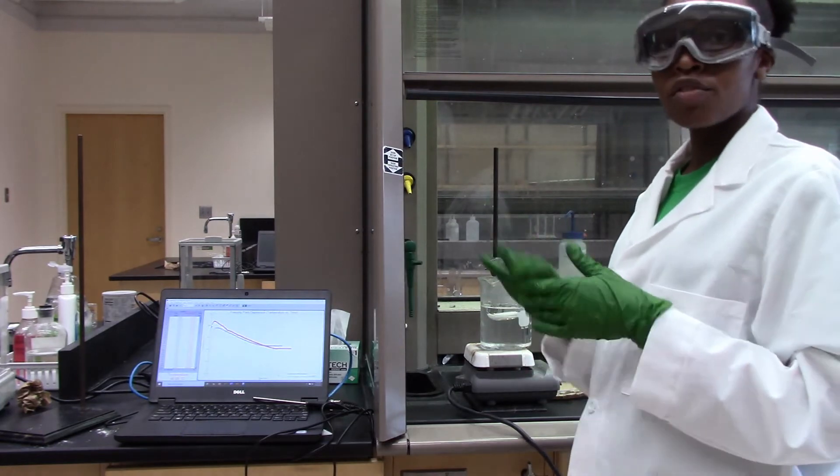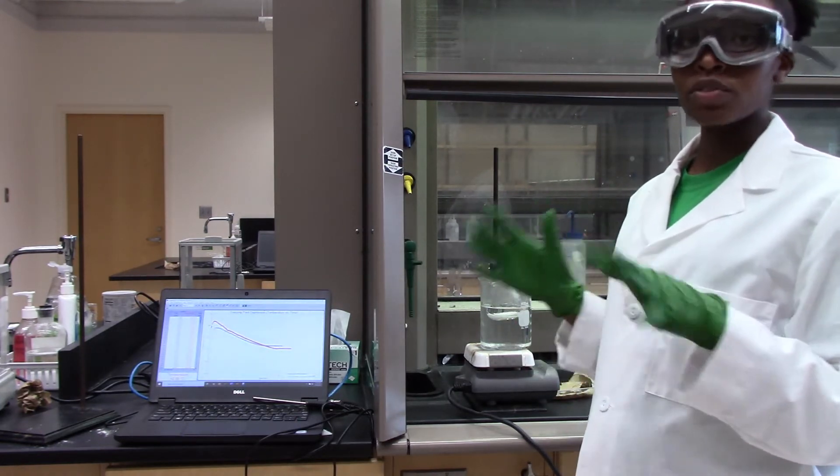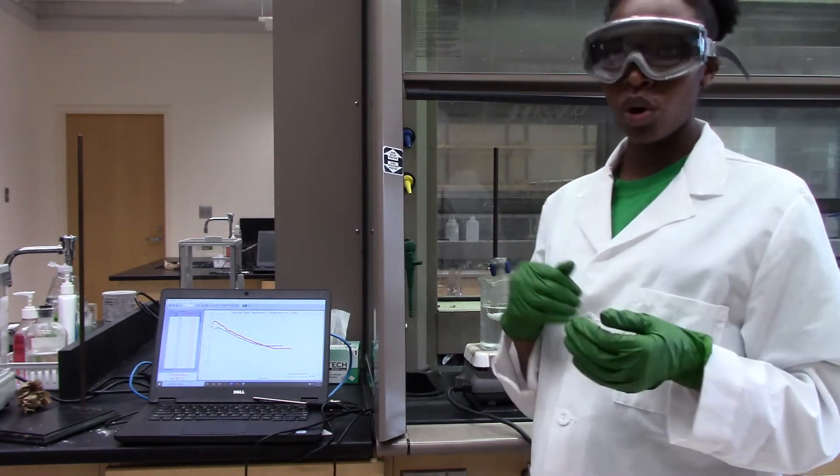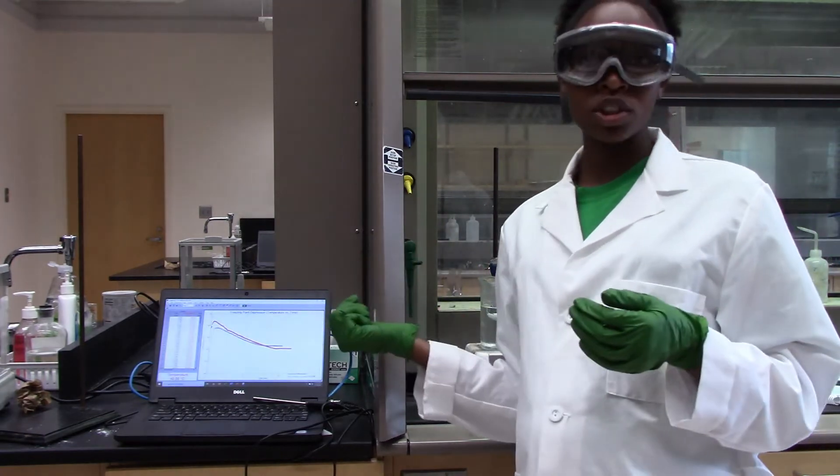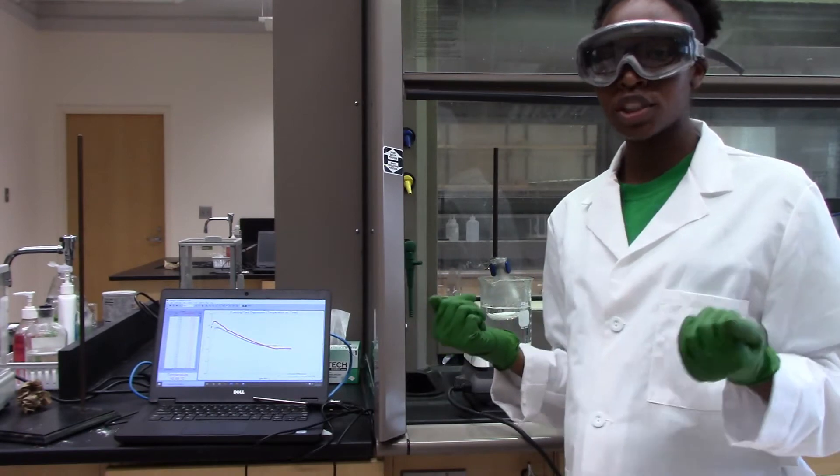So I'll just wait for the lauric acid to melt and wait for the temperature to be about 60 degrees Celsius. And I'm going to start monitoring the temperature change as it drops from 60 until I get that freezing point temperature.